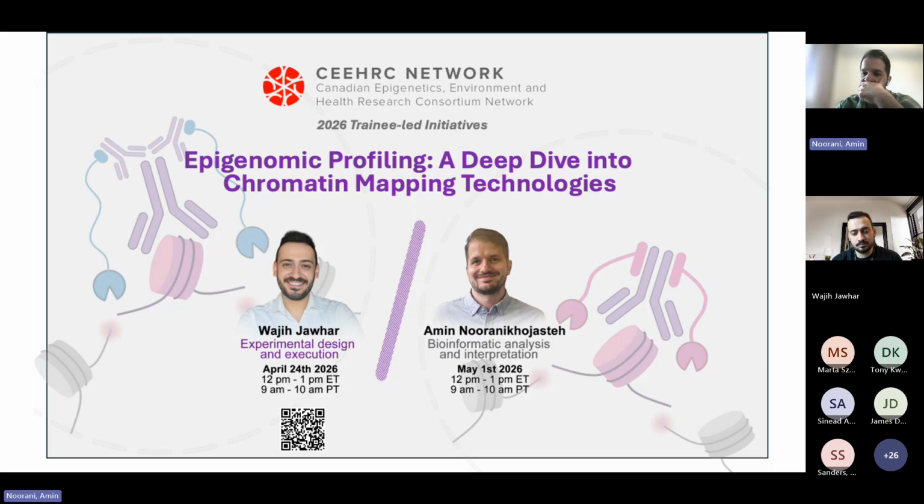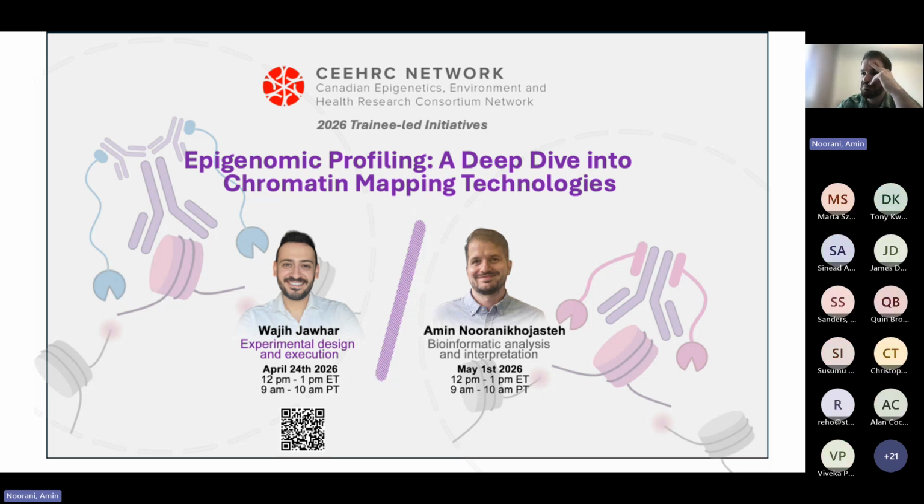Another question: is there any recommendation or tools for reducing batch effects? Sometimes it's not possible to process everything at one time. There are a few approaches. Batch effects are always a problem. At the experimental level, always have the same reference sample and control across batches. That's the first one.